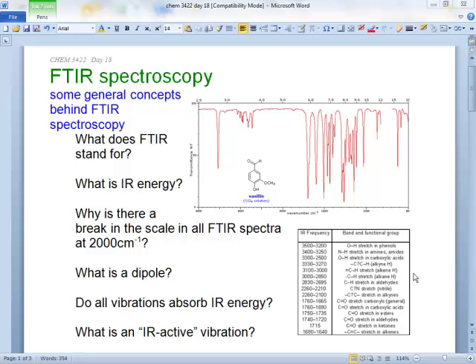Why have this machine? Like Rob asked a good question once before. Why have the AA, right? And we answered it in the metals. Why have the FTIR? Anybody? Why have the FTIR?